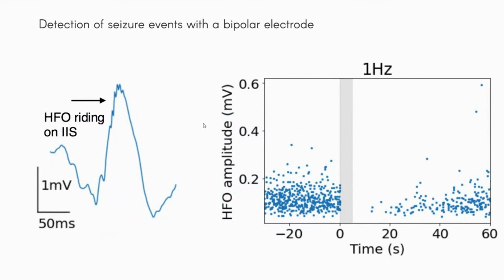And my experience with this has been mostly in epilepsy. So I have done a bunch of different epileptic models where I'll either use electrical or kainic acid basically to damage cells in real time or chronically. And for my kainic acid experiments, I'm basically looking at local field potentials in the hippocampus. And here you can see these sort of large oscillatory events that have these high frequency oscillations riding on top of them. And these are very typical seizure events in the kainic acid model.